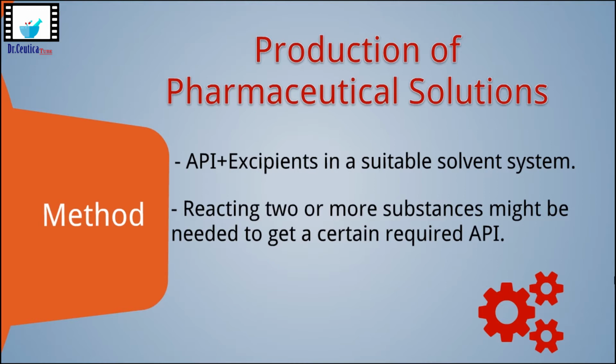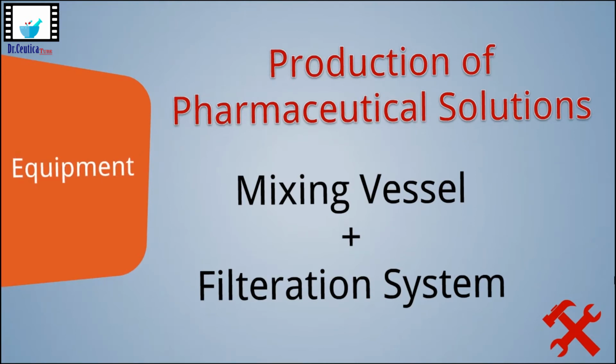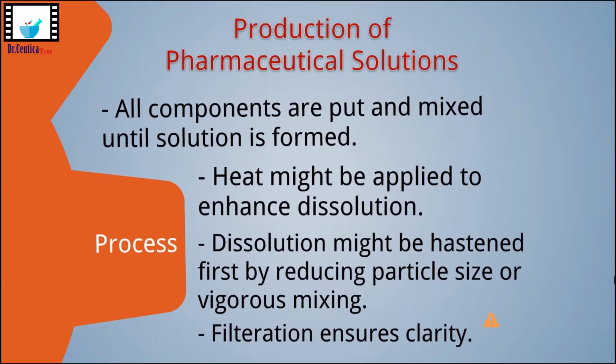Yet in both cases, whether we have all ingredients ready or we need to do some steps first, the only necessary equipment is a suitable mixing vessel and a filtration system. All ingredients are added to the solvent in the mixing vessel and mixed until a solution is formed or the solution is complete. Sometimes heat is applied to enhance the dissolution, if it's a better option than reducing the particle size of the solutes or subjecting the ingredients to vigorous mixing, which are all techniques to hasten or enhance dissolution.